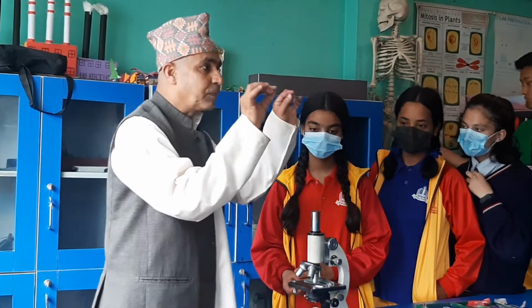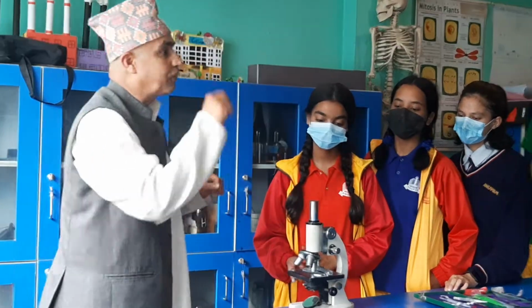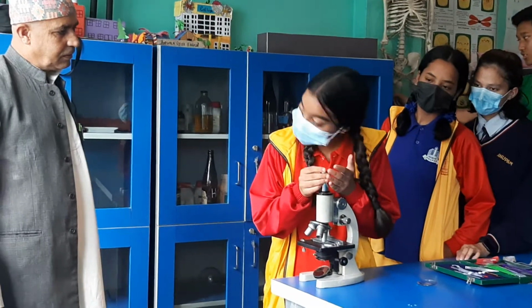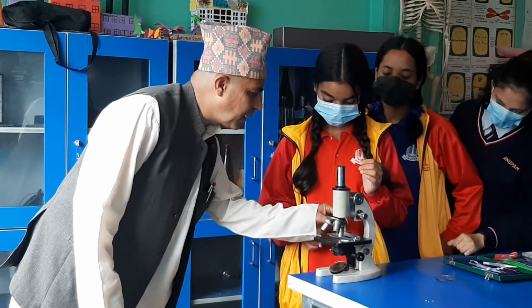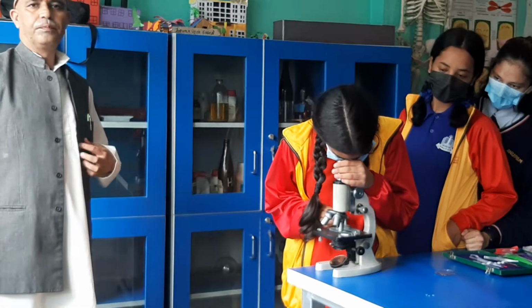Now you can see the clear cell wall. What can you see? Clear cell wall. Now you can find out. Okay, please see. Is there a black thing, box-like also? Don't depend only upon me. To move forward, backward, you can move this one. Okay, check. You have to learn.